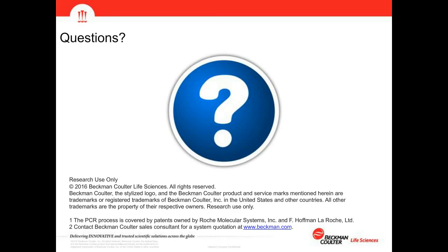Okay, so I can answer that question. This is David. The answer is yes. The Biomeks do have options for either a 96 or a 384 well head. As far as the second part of the question, the heads cannot pipette individual volumes as a 96 or 384 well transfer. However, we do have the enhanced selective tip pipetting heads, which are capable of doing individual row, column, or individual well pipetting. So if you did have a 96 or 384 well labware format that required different volumes in different wells, you could use the enhanced selective tip feature to either deliver or aspirate off different volumes from different wells within that 96 or 384 well labware.